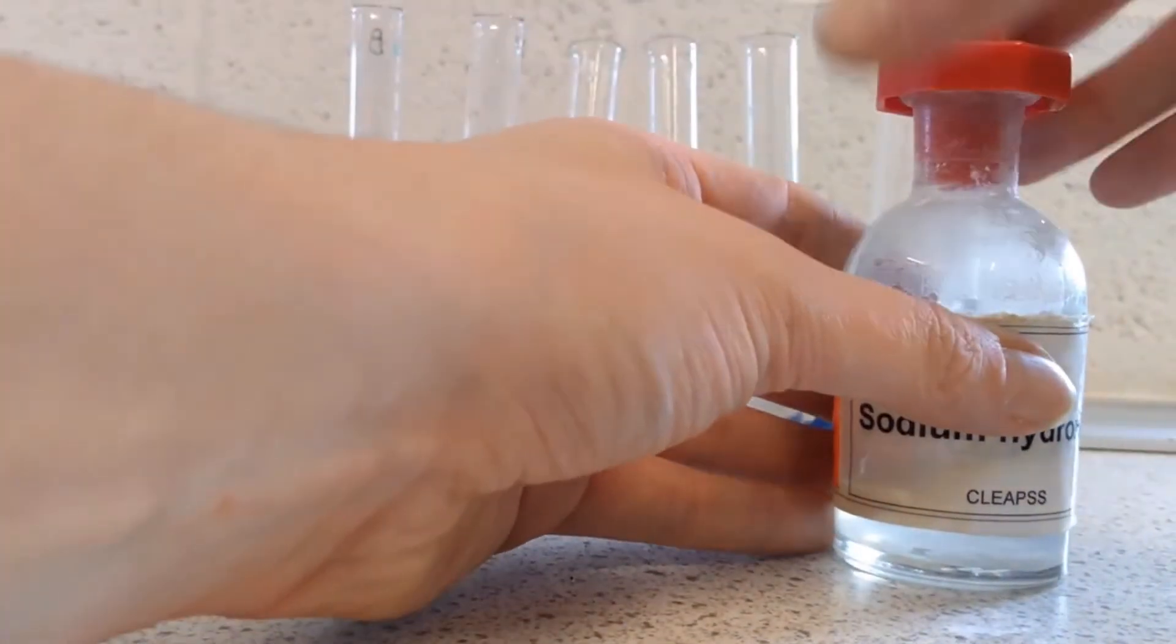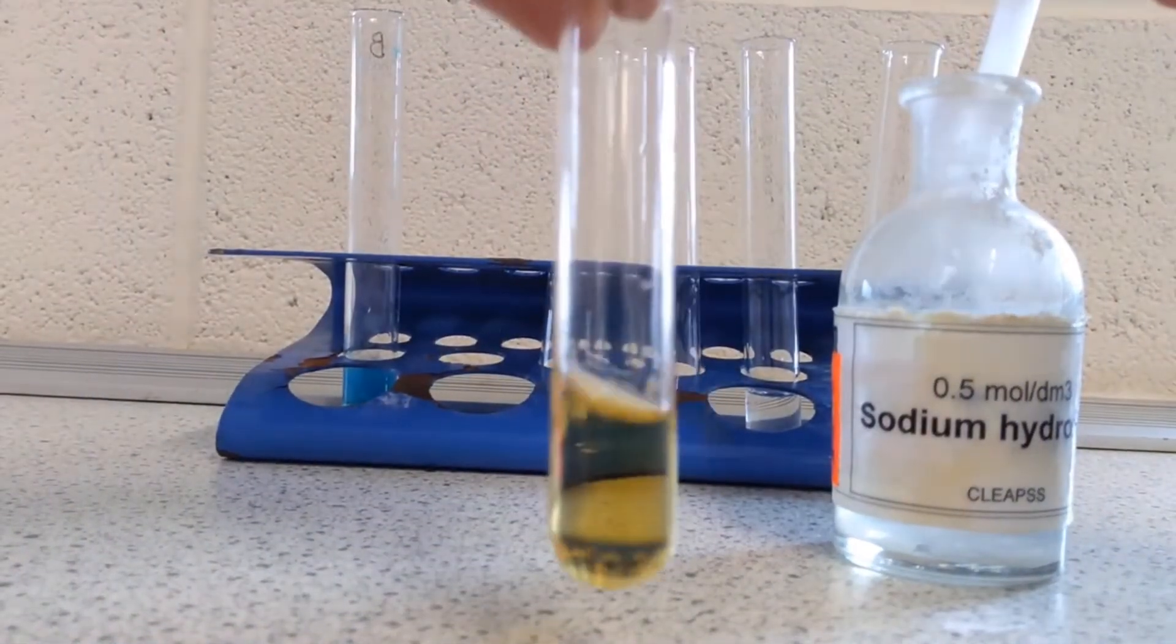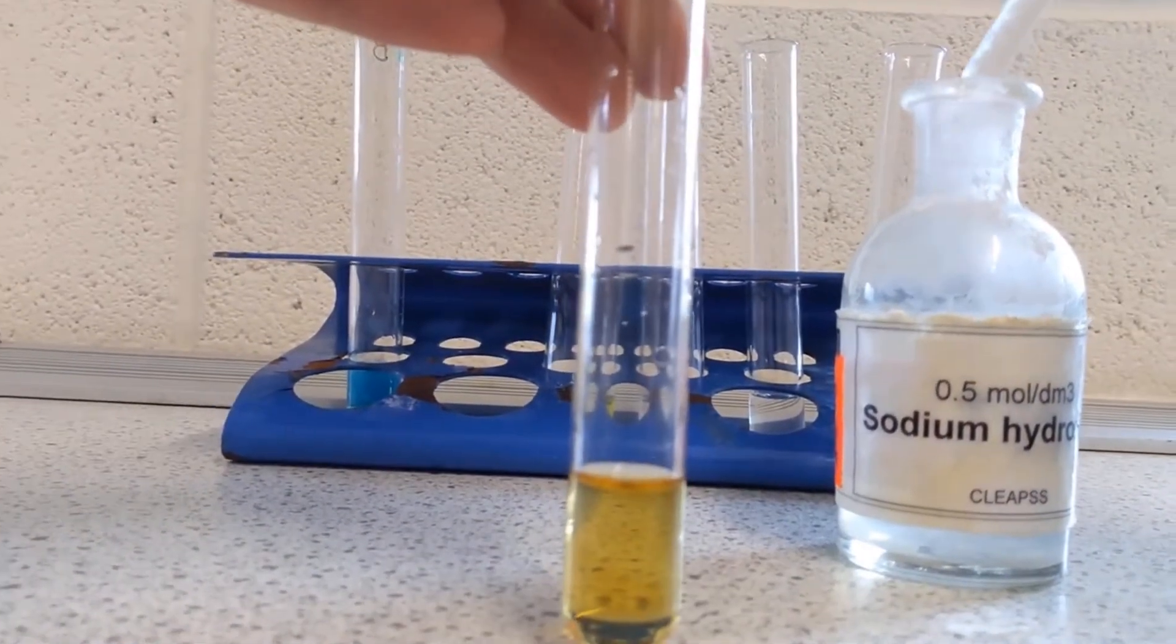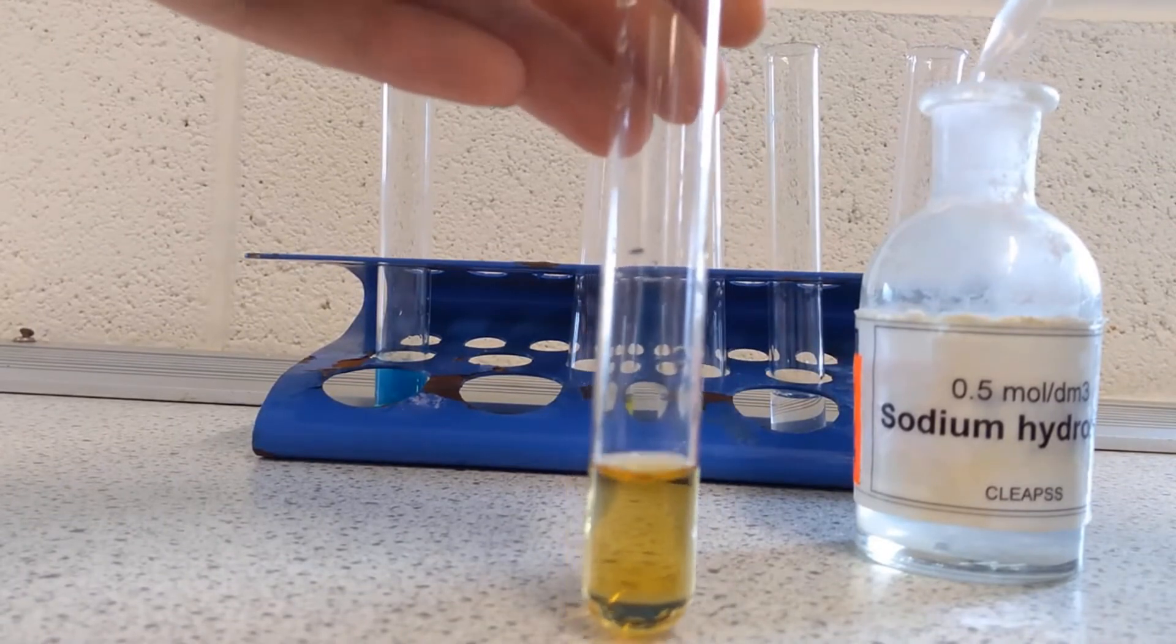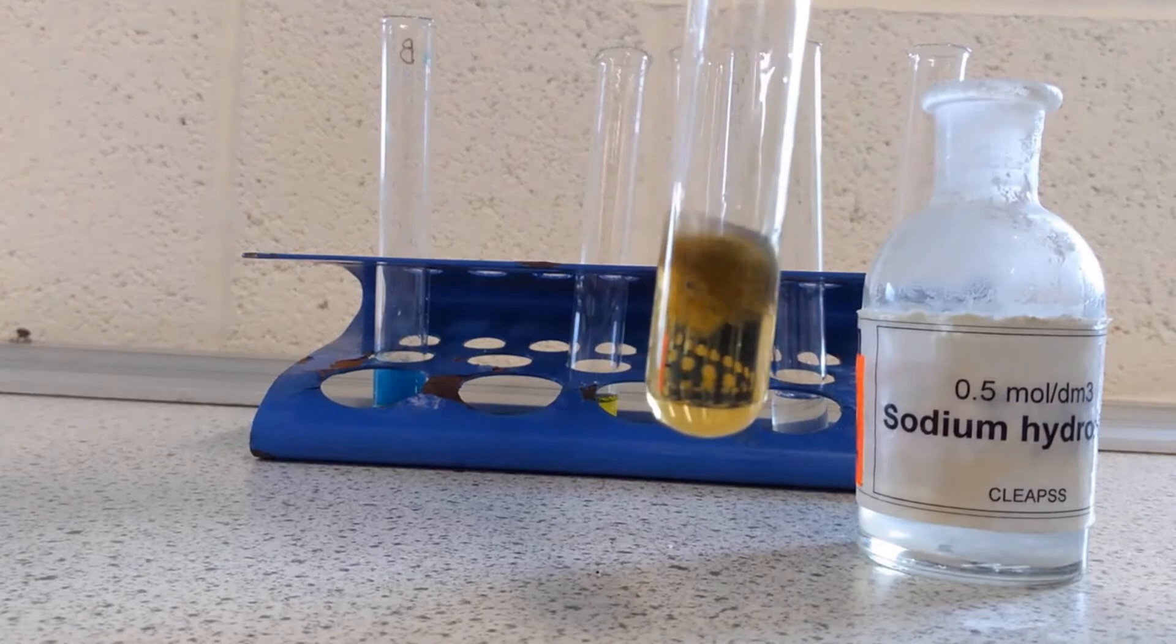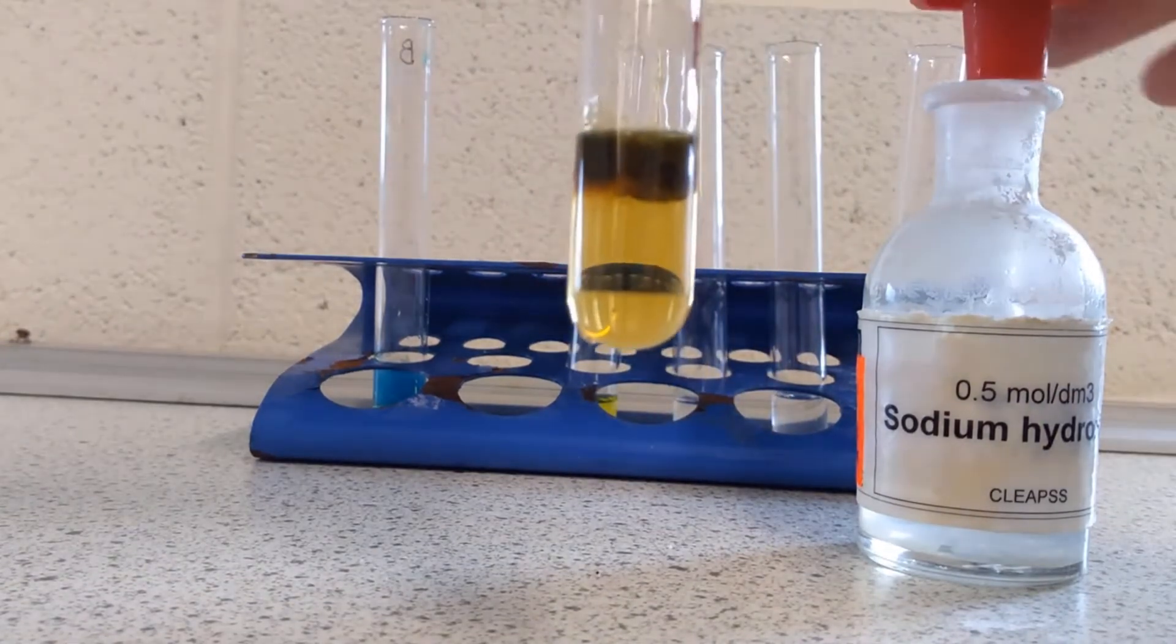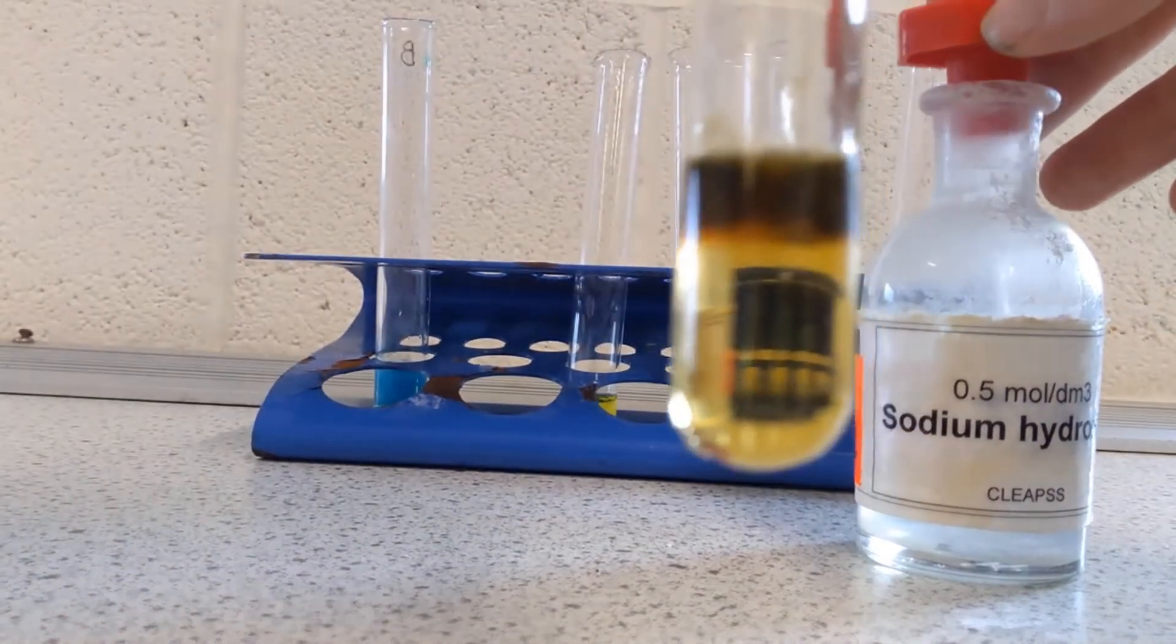And then likewise this next one is iron 2 plus ions, because remember, iron being a transition metal has multiple stable ions, so these are the iron 2 plus ions, and they produce this characteristic dark green colour.